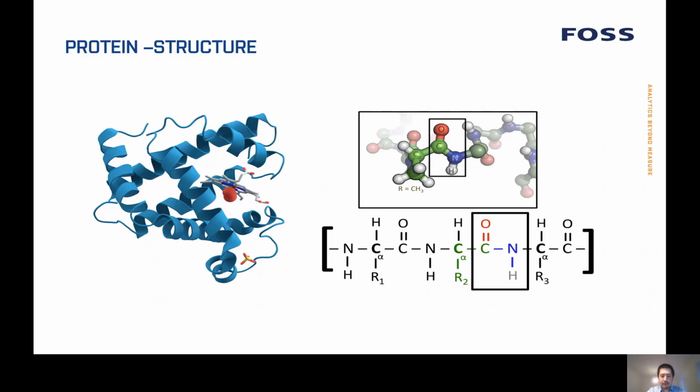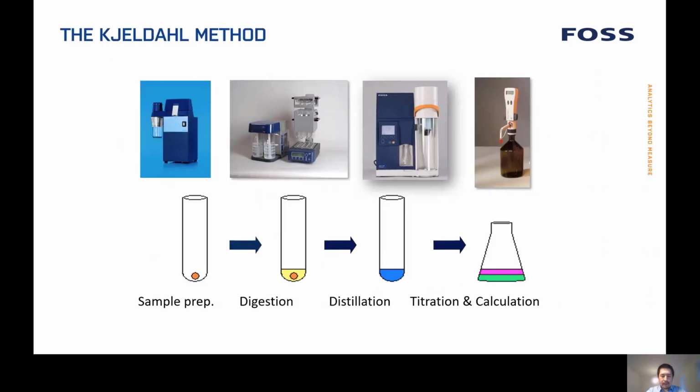If you break this organic protein chain, you can get this nitrogen. And the way in the Kjeldahl method is to break this nitrogen into inorganic ammonium ions. Then you determine it based on the Kjeldahl method. The Kjeldahl method actually contains 4 steps. I'll give you a very clear picture of what they are.